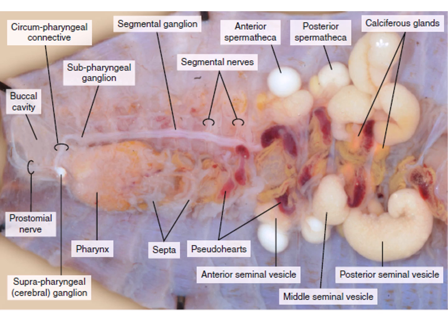The dorsal blood vessel, we saw, is running on the dorsal side of the intestine. There would be a ventral blood vessel present, but we cannot see it because the digestive system has covered it. We have to retract the digestive system toward one side and see the ventral blood vessel underneath it. We will see it in the next slide.